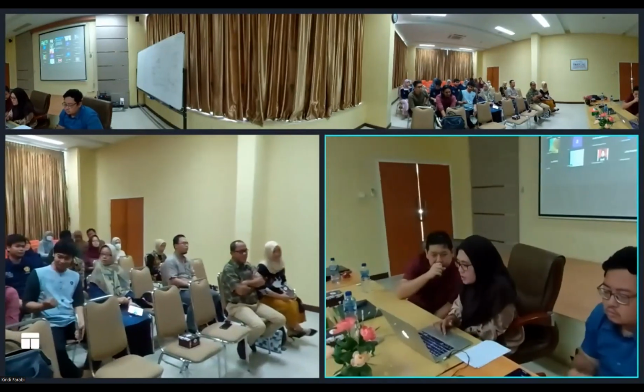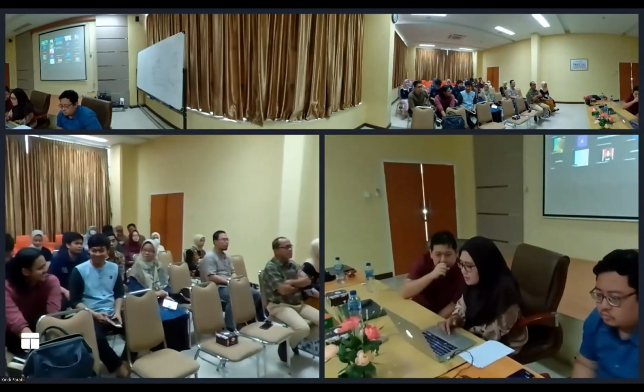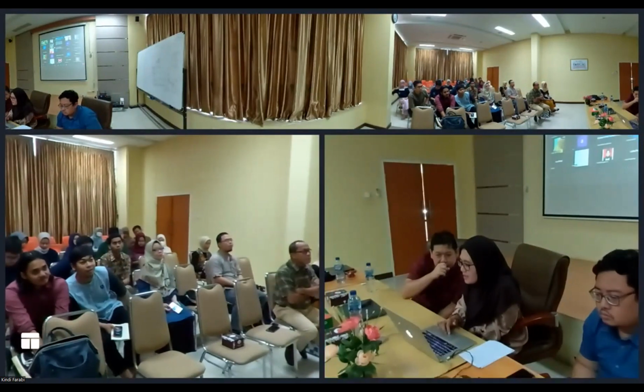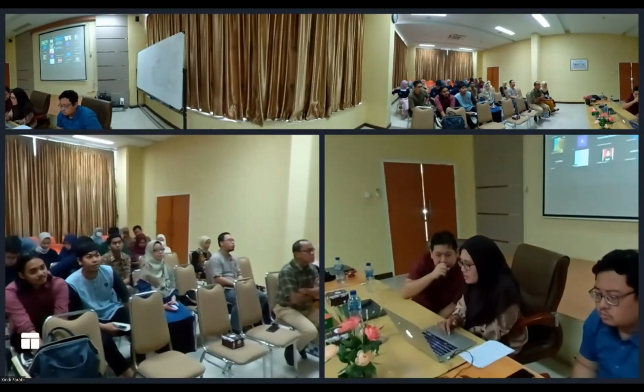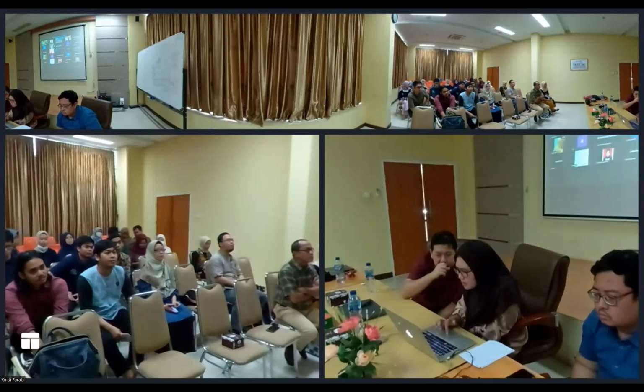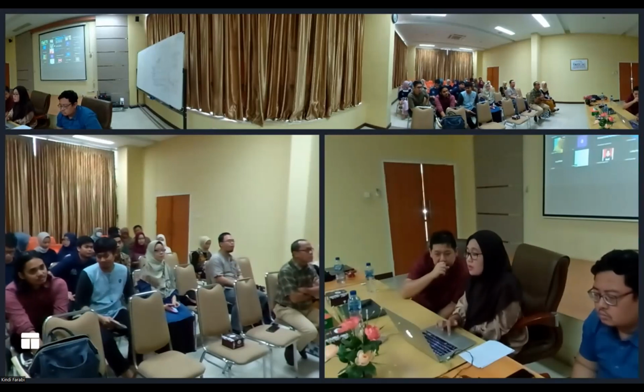We have several questions in Zoom. I will read the question. Mr. Sia, I have a few questions about ionization. I'm very glad if you would answer these questions. First, can a sample get ionized by 2 electrons? So we get a fragment that is cut in the middle of the structure. And the second question is, how about if the molecular mass peak doesn't get detected? Is it possible? And what may be causing it? Thank you.